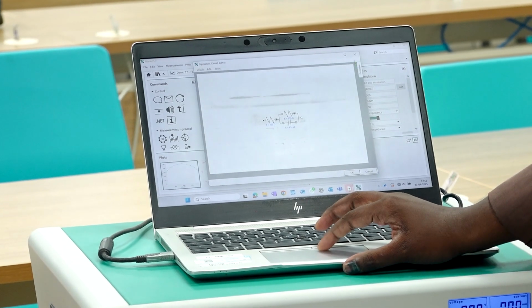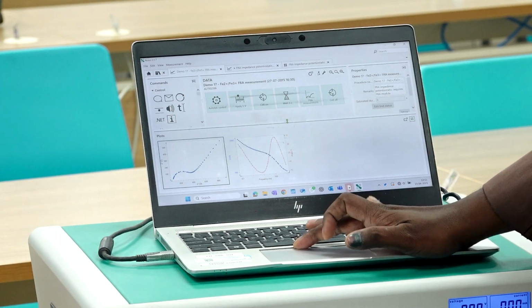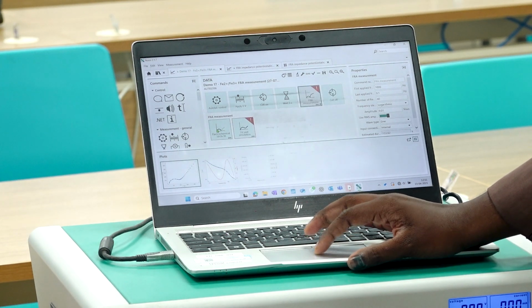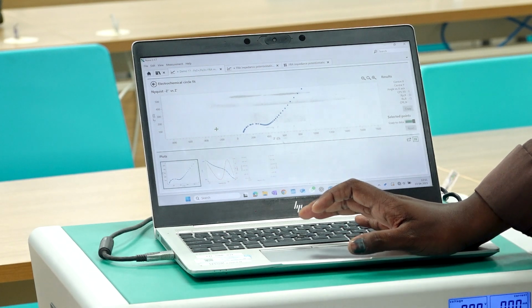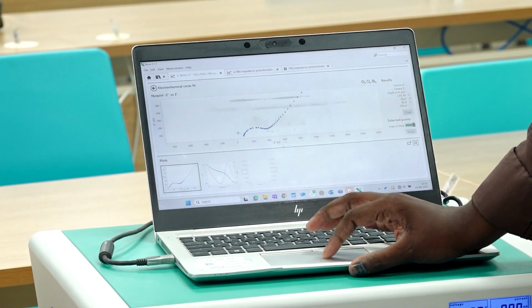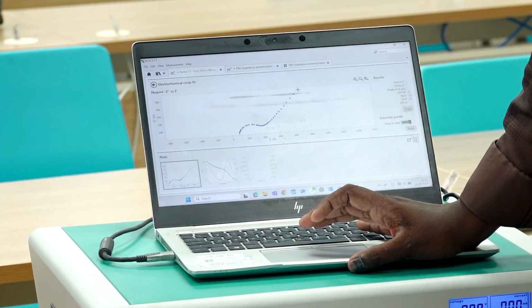Okay. Now you try to fit the Warburg. So what we have to do for fitting, for creating a circuit, what is the first step? Yes, we should select the point. Which point we should select? Starting. End means this end, right? She's telling us.